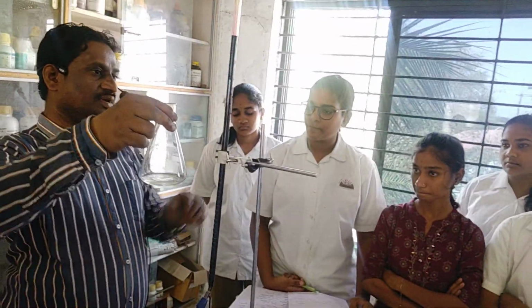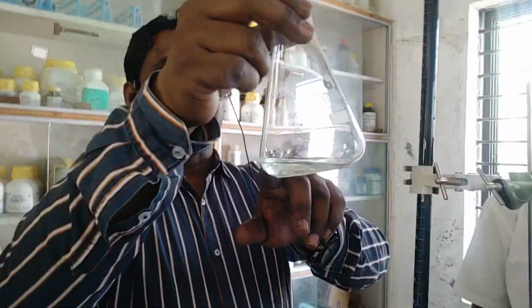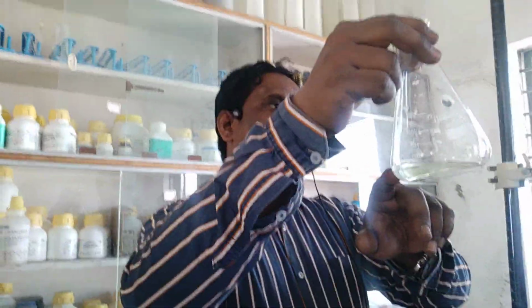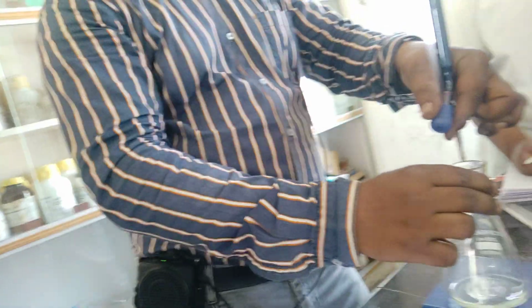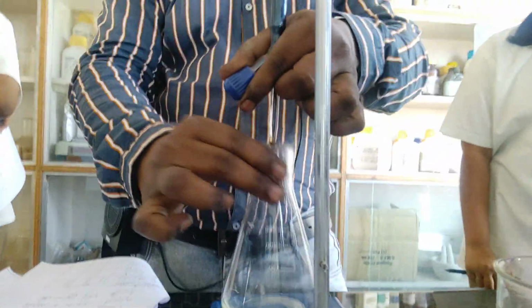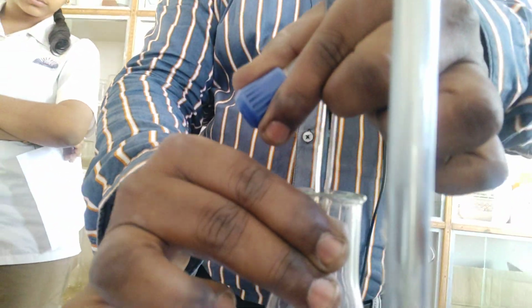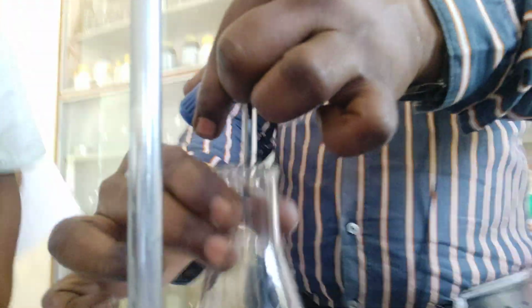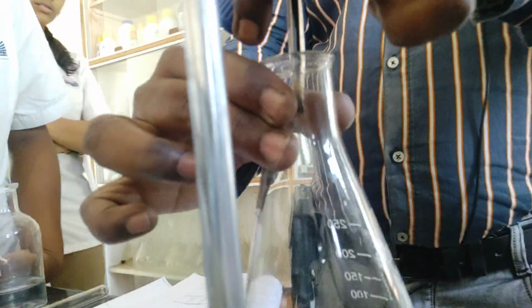Is it clear? So we are titrating it against KMnO4 solution till colorless changes into pale pink. Colorless should change into what? Pale pink. Now observe carefully, all of you look carefully. Slowly, just one drop you release and slowly shake that. Don't release fast. While releasing also, this should be near your side. Slowly, observe here carefully.